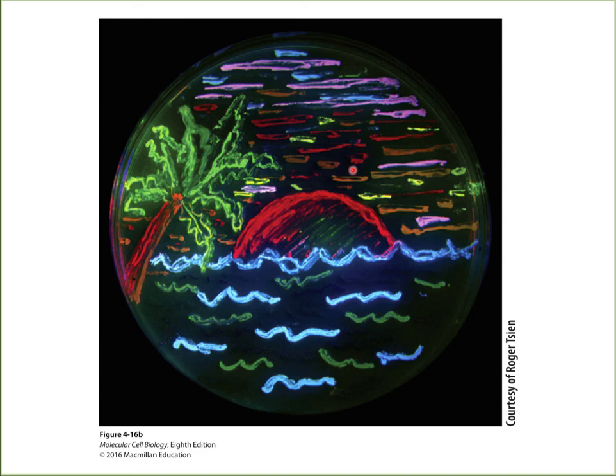You can remove the filter and allow all of them to pass, but at that microscopic scale, all of them will look very blurred, and you will not get a nice picture. So in fluorescence microscopy, in reality, you have a specific emission filter, and you see each of these colors individually, one at a time. Then if you wish, you can merge them all into one image. But that's not the case here because this is very large. This is a Petri plate 10 centimeters wide.